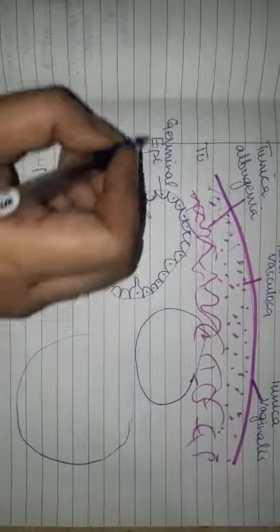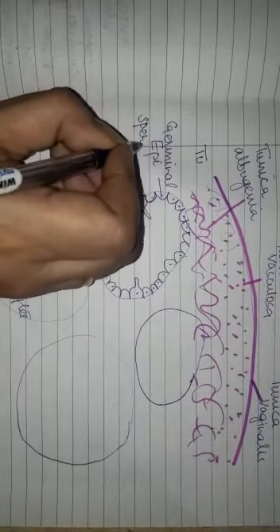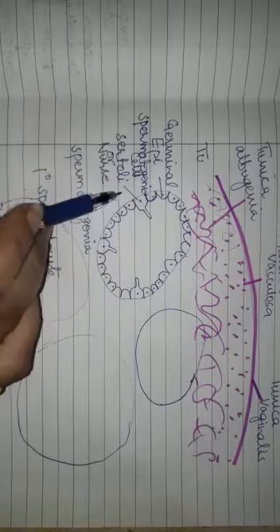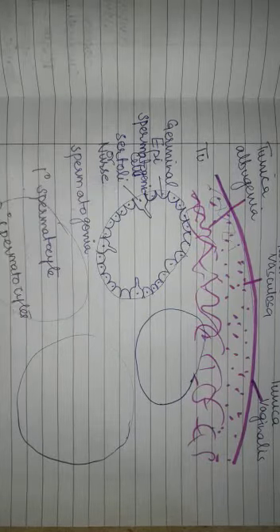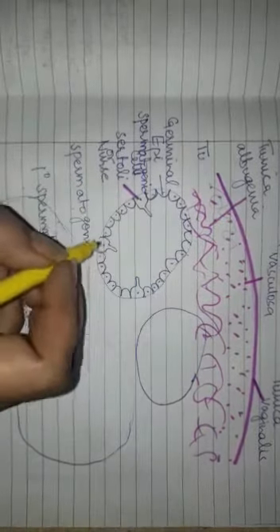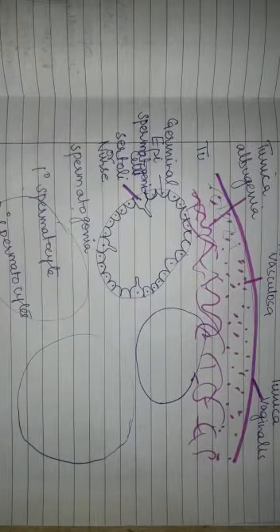These are called spermatogenic cells. और ये जो लेयर बनाते हैं उसको क्या बोलते हैं? That is the germinal epithelium. Few cells in the germinal epithelium are large, pyramidal and supporting cells, and these are called the Sertoli or the nurse cells.